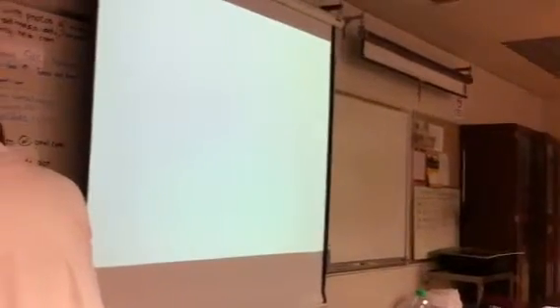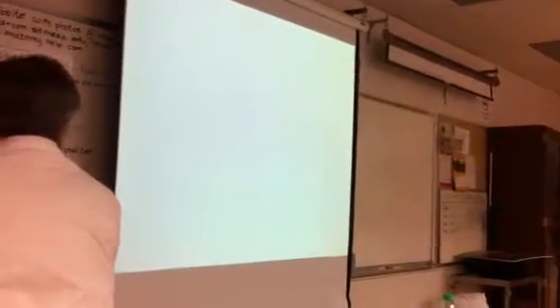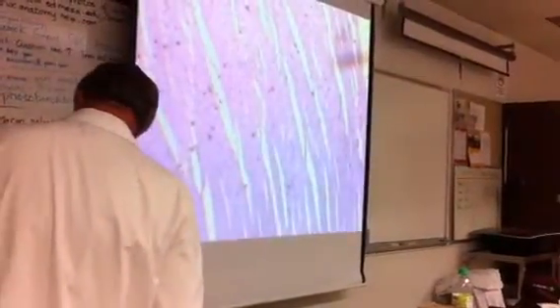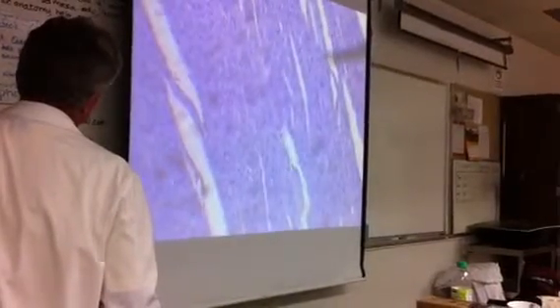This one, let's see this one. You've seen this one before as well. There it is. This is cardiac muscle.